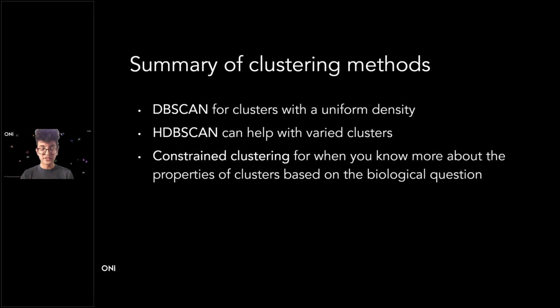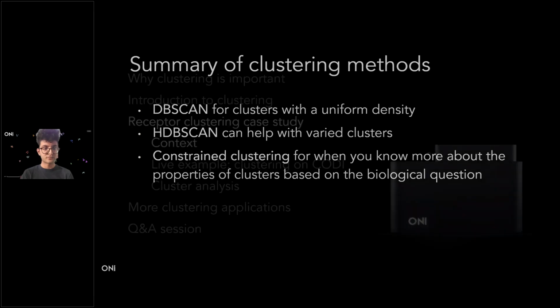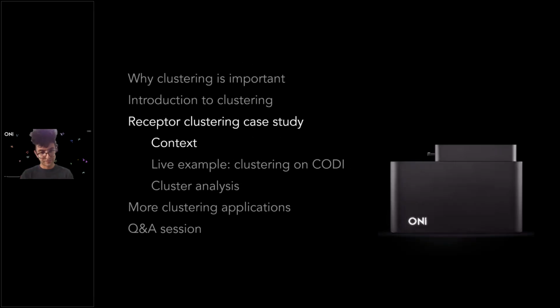Okay, so these are the 3 methods, and we're going to have a quick look at how those are used in practice in our case study. So first, we're going to go through some context, then I'll show you a live example where we perform clustering on our analysis platform, and then we'll have a look at those clusters in analysis and see how we might be able to interpret the clusters that we have found.